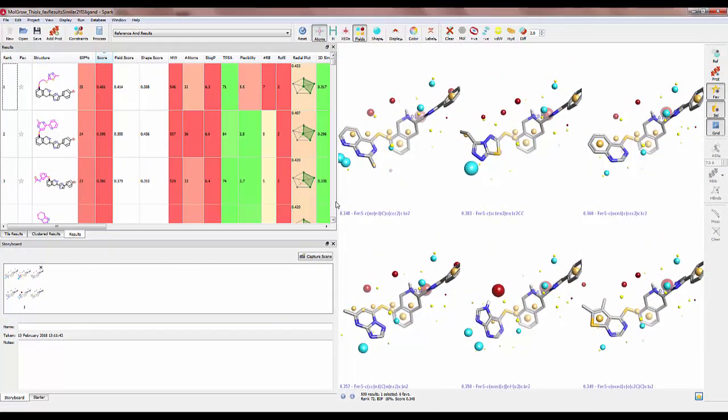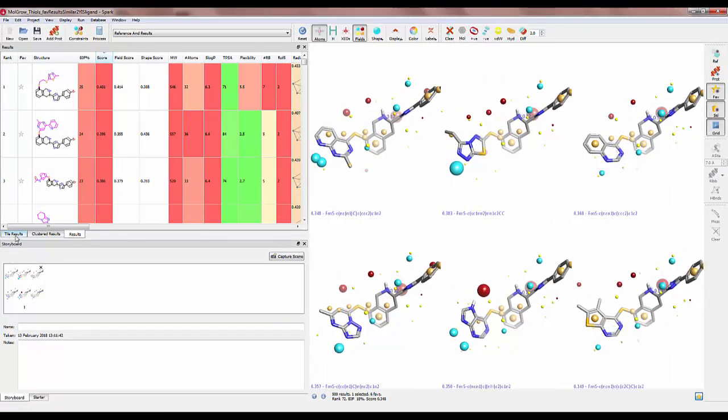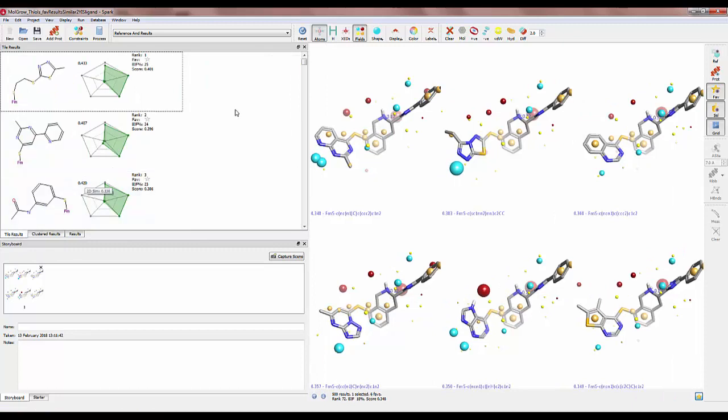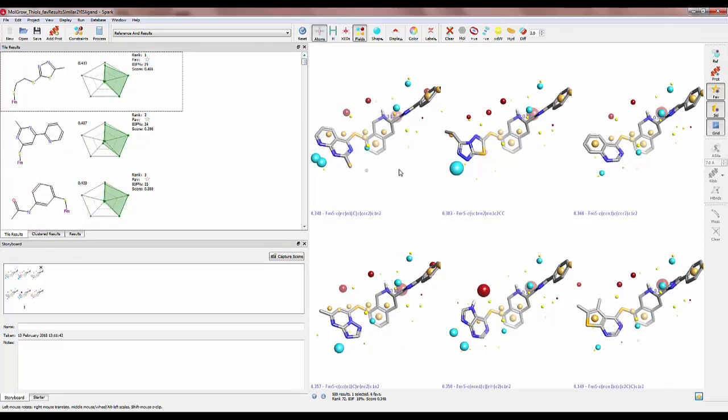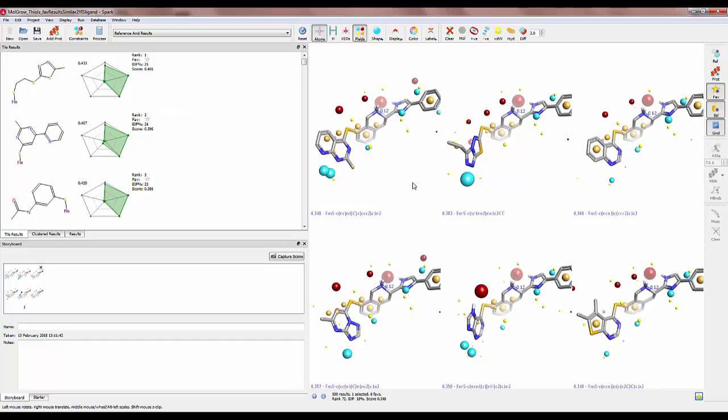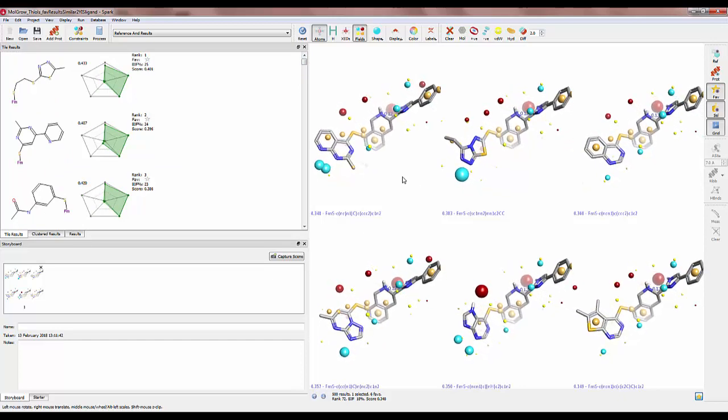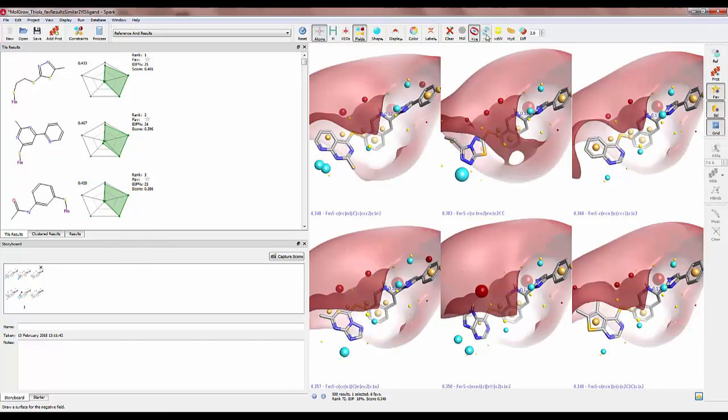When the experiment completes I get a set of suggestions that have sulfur as the linking group. I have a few of the hits set as favorites. Each of these have a similar structural motif as the ligand from PDB2YIS which Pfizer put forth as a COPD candidate.